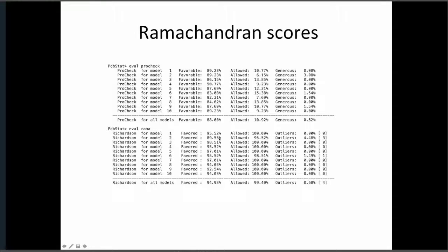As you see, they are slightly different, and this is because they use different mappings, different considerations for every residue. I guess people tend in all our meetings to trust these things more, but anyway, you can do this better with the Richardson software. The only thing is, once you load those PDB files into PDBStat, we thought it was handy to have this application.